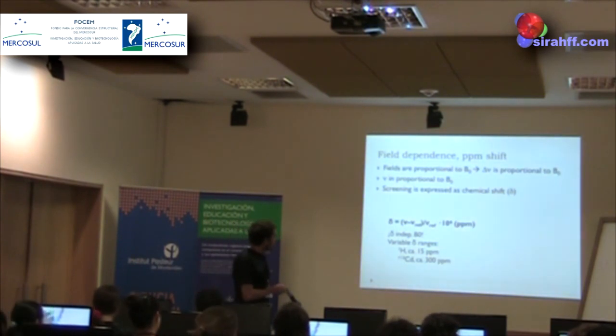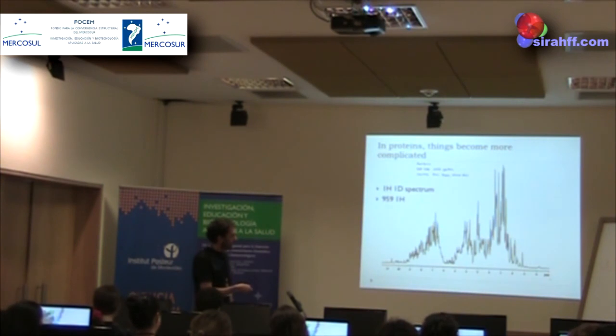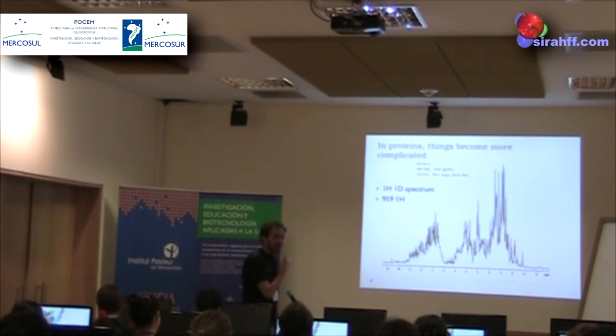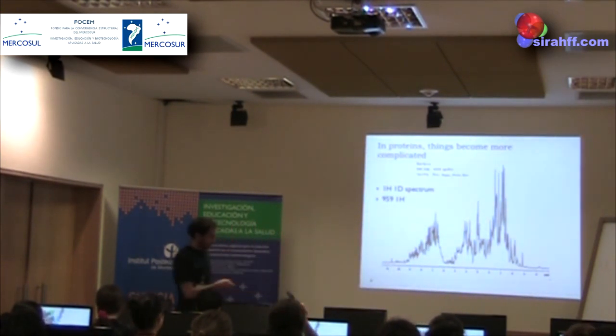field. So this kind of spectra will look the same in the ppm scale, independently of where you acquire them. They will look the same in a 900, 400, 600 megahertz spectrometer.